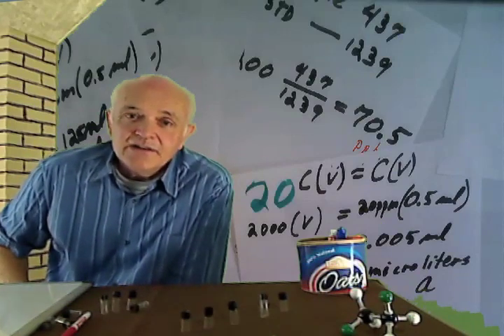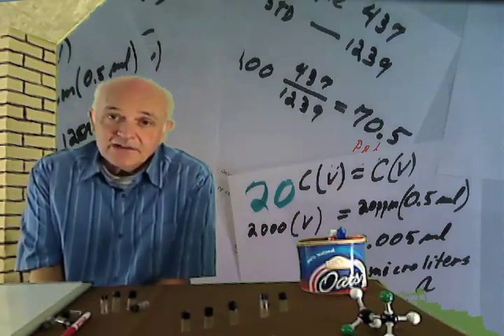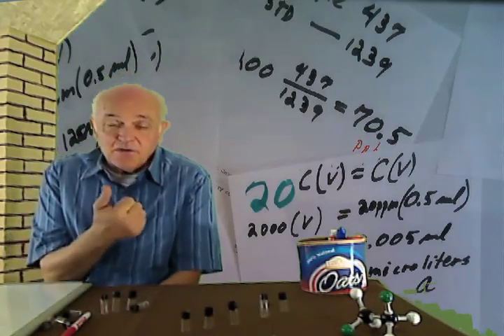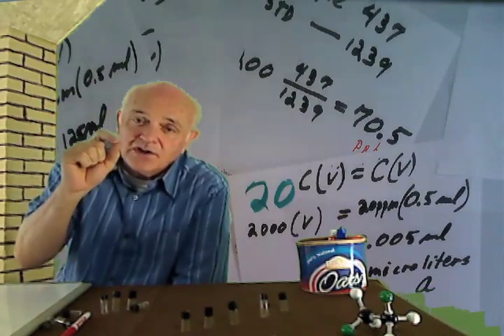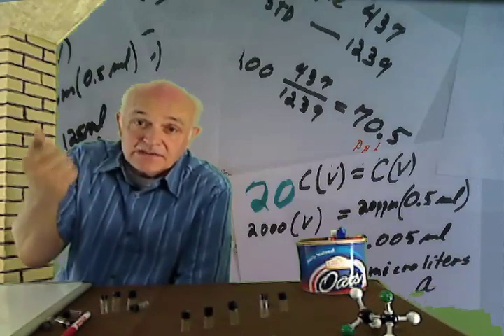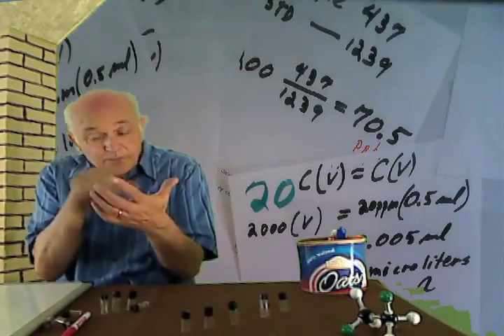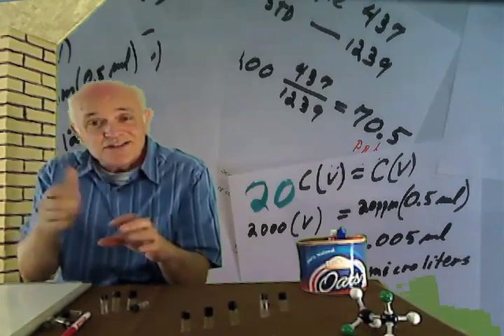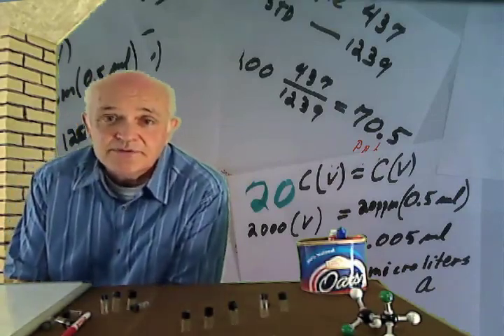And then the way to add the methylene chloride to bring it up to volume at 0.5 is to get an automated, adjustable pipette with 1 milliliter, dial in the first volume you want, air out the pipette. The methylene chloride is very volatile, and it'll tend to want to blow out of the pipette and mess up your volumes. So let the pipette come to equilibrium, and then do the first one, punch in your new number on the pipette, do the second one, punch in the new number, and so on through the fifth, and throw the pipette tip away. It's all methylene chloride, so you don't need to use a bunch of different tips.